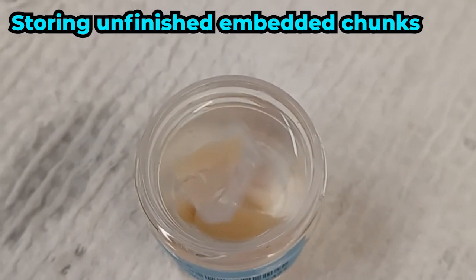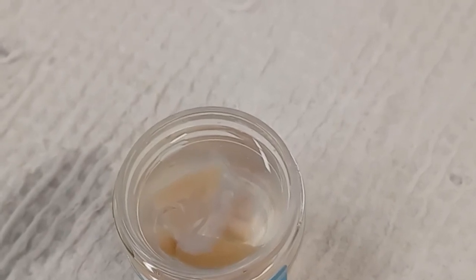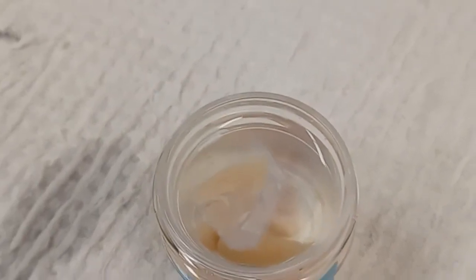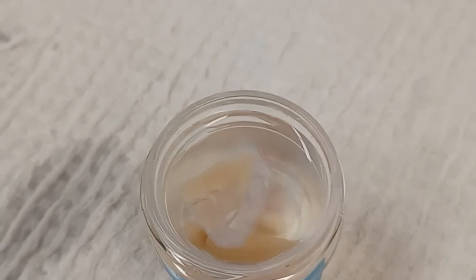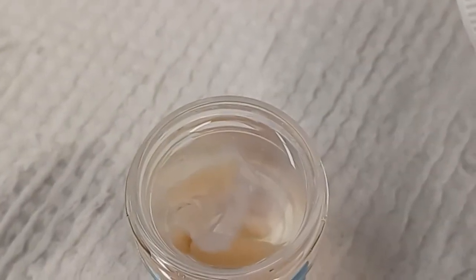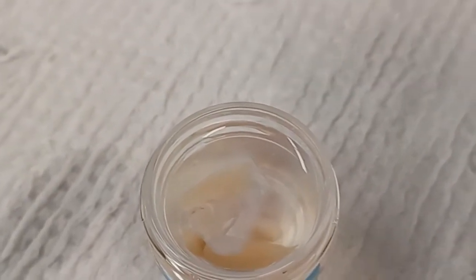Although agarose swelling might be a problem when cutting submerged on the vibratome, if you don't have time to cut embedded blocks or you lose track of time, you can always put the embedded blocks back in the same solution container as the brains — PBS with sodium azide at 0.05% solution. They'll keep in the fridge just fine. When you take them out, dry them off, put the flat side down, superglue them in place, and get to cutting. That's it for this video. If you have any comments, feel free to leave them in the comments section. Take care, bye.